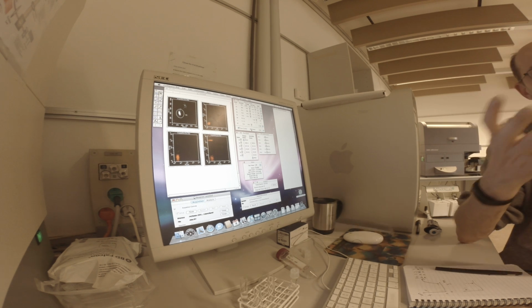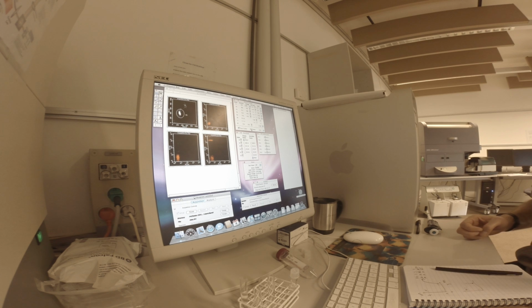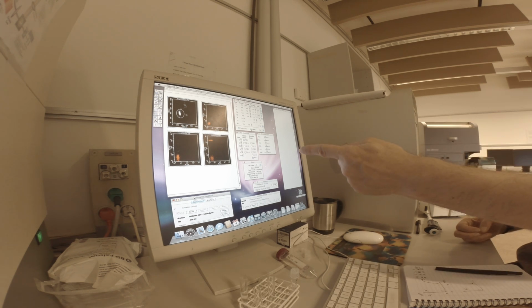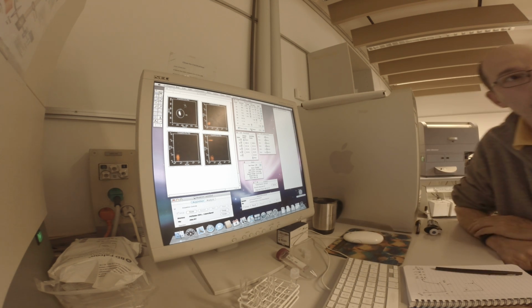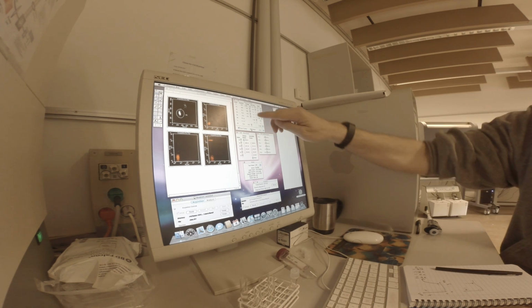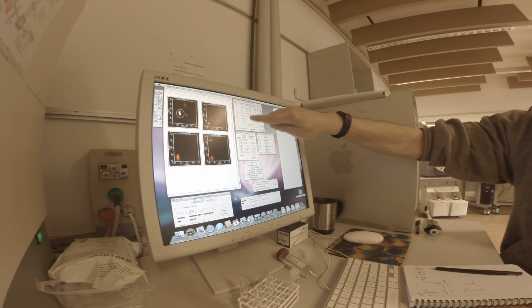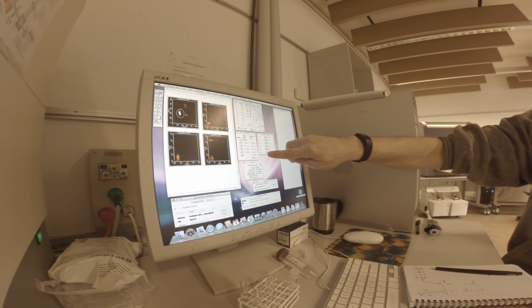And this is why it's important that five students sitting next to each other start comparing notes. They can actually see they get five different settings, yet it is working for them. But those five settings wouldn't be completely different. No, they're close by, right? It will be within 10, 15 in voltage, here 0.123 or so, and here perhaps 1 or 2.